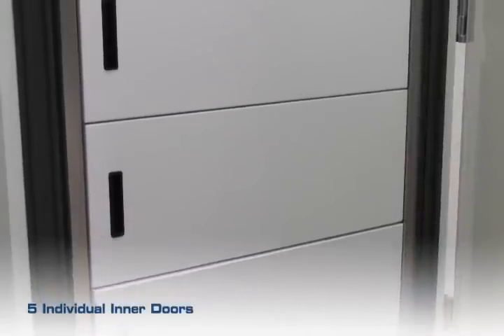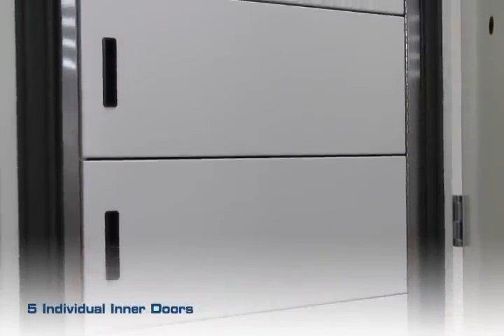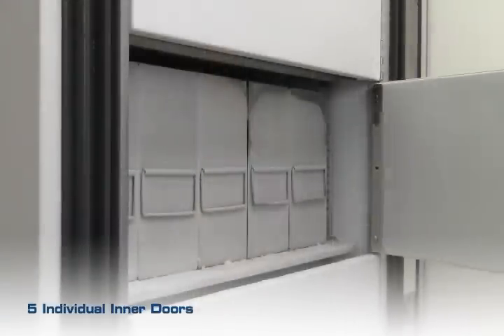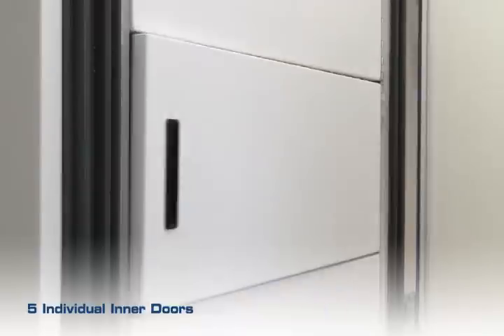Five individual inner doors can be opened independently to minimize sample exposure. One continuous stainless steel hinge is used for excellent alignment of the inner doors, ensuring a good seal. Magnetic door contacts allow for rapid closure.